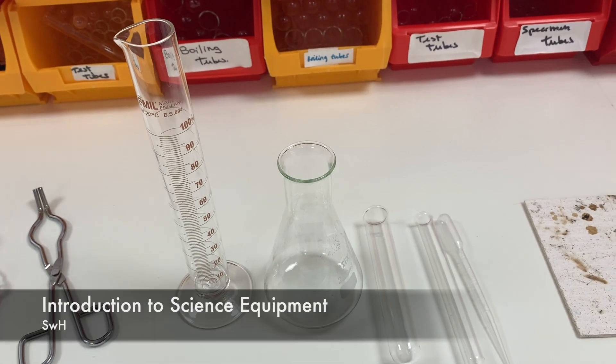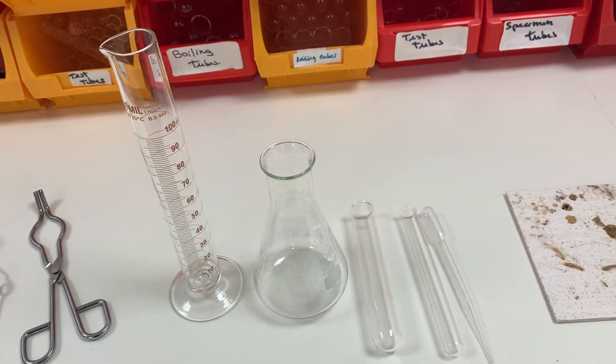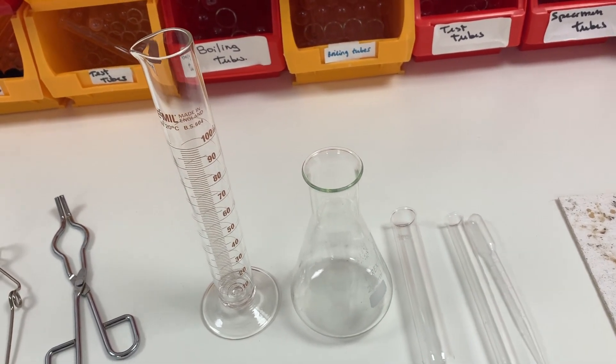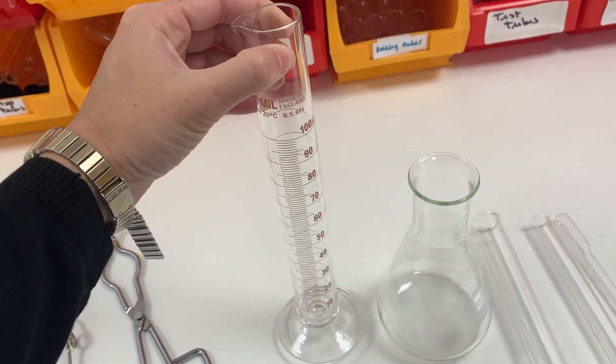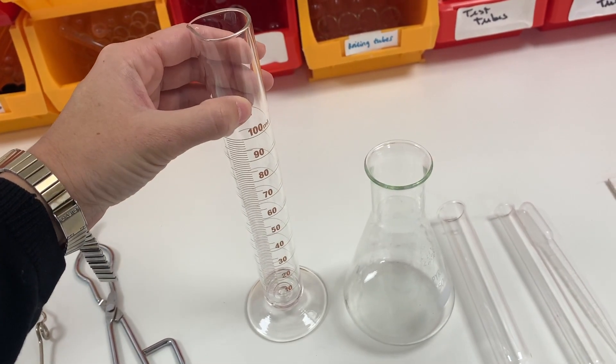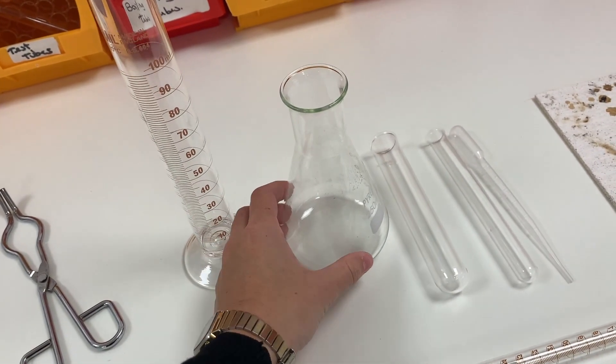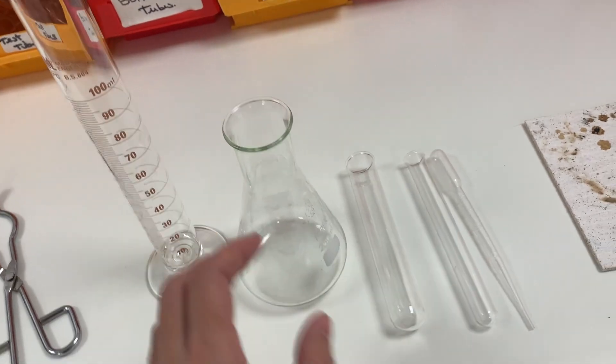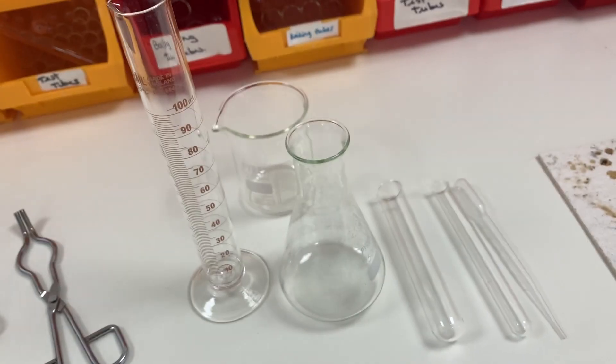Hi everyone, this is just a quick video to show you the key apparatus that you use in scientific experiments. Starting with this measuring cylinder, this is quite a large measuring cylinder that measures to a hundred centimeters cubed. Next we have a conical flask, and over here we have a beaker. All three of these apparatus are used to measure volumes of liquid fairly inaccurately.